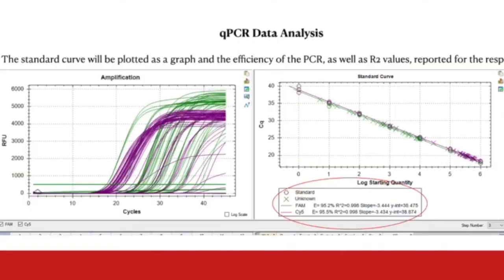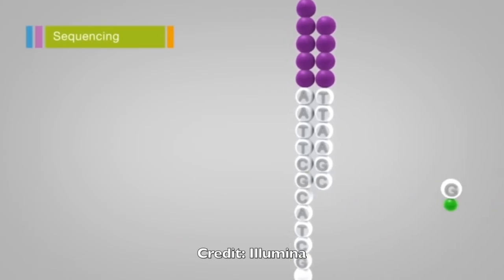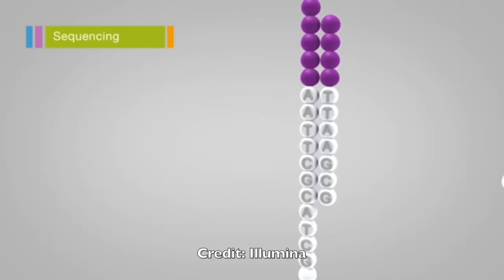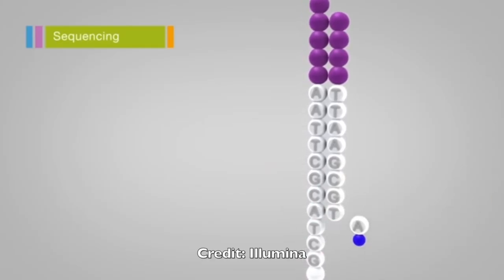And in this process, you would have to perform data analysis. You have to normalize the data. Nowadays, the preferred technique for detecting differences in genes tends to be RNA sequencing.